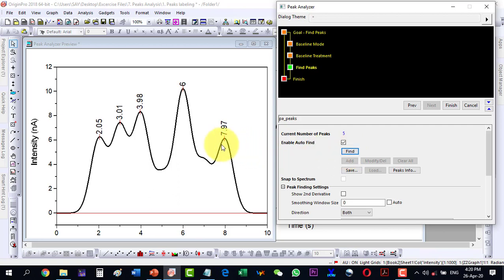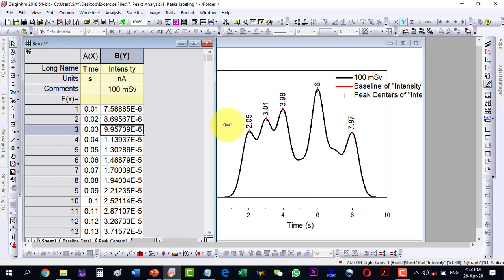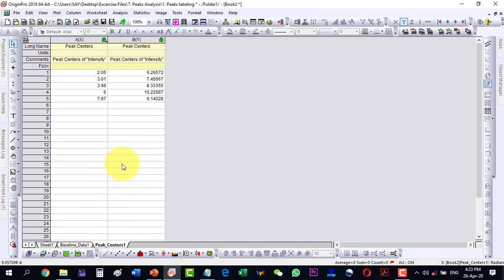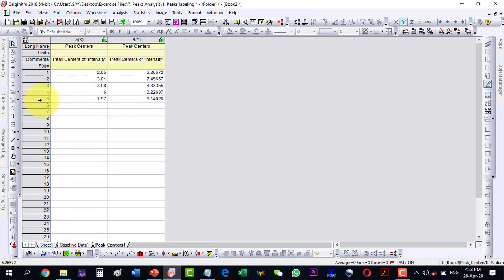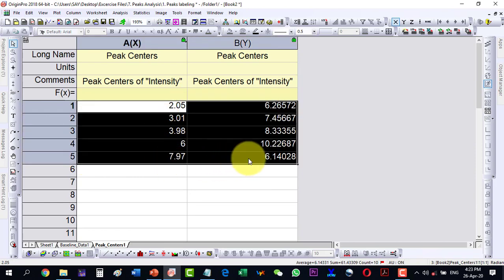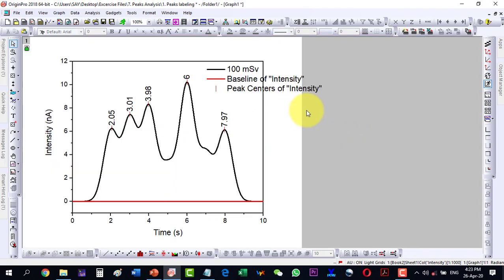Click Find and we see that it has found the peaks. Let's finish this and now we have all five peaks here, along with the baseline. If I go to the data, I can see the baseline data and the peak data — these are the locations on the x-axis of the peaks and their respective intensities. So Origin can find peaks for us automatically.